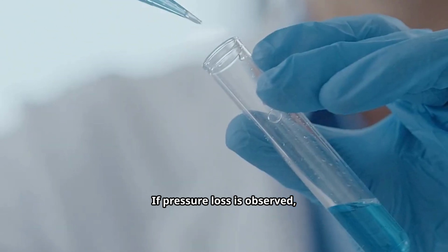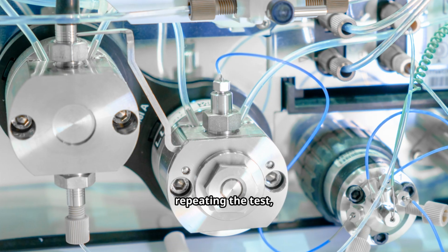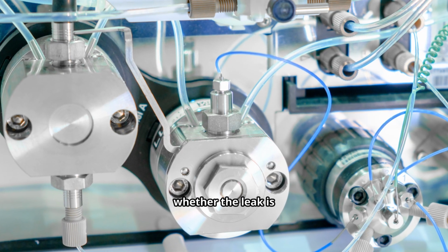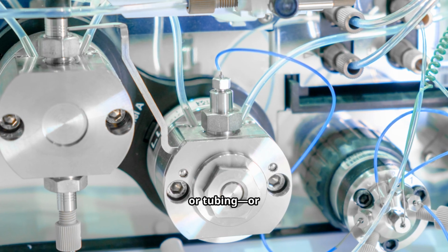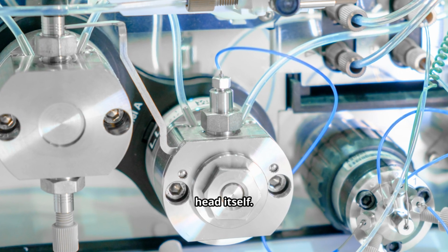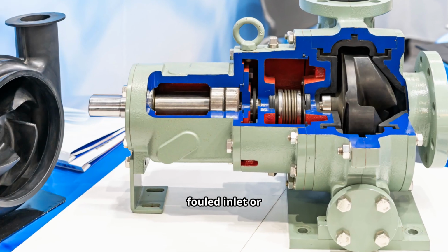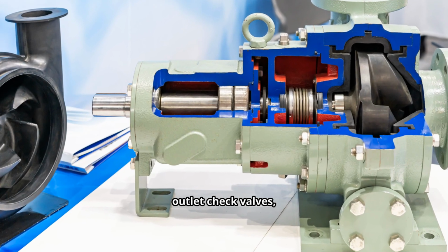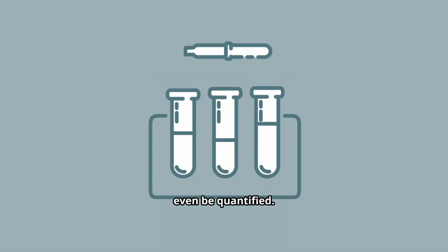If pressure loss is observed, isolation begins. By capping the pump outlet directly and repeating the test, you can determine whether the leak is downstream, such as in the mixer, pulse damper, or tubing, or internal to the pump head itself. Internal leaks most commonly originate from worn piston seals, fouled inlet or outlet check valves, or a purge valve that does not fully seal.